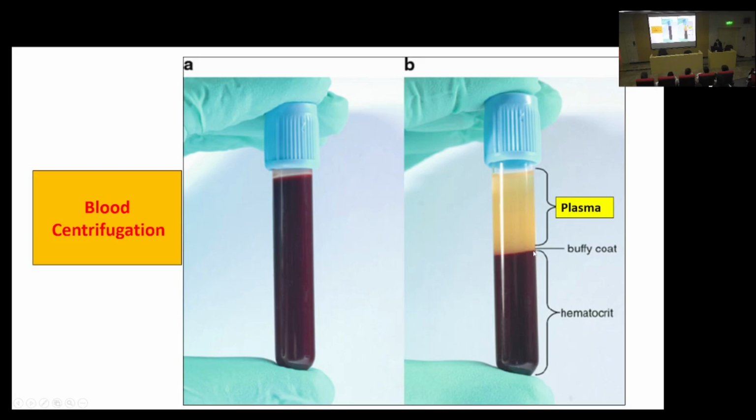The middle part, the buffy coat, I know it's not clear in here, but sometimes if you want to do PCR on DNA, right? So you'll get the DNA from white blood cells. You can't get it from red blood cells, can you? Because red blood cells don't have nuclei. Same thing with platelets. But what we do is we aspirate the fine white cloud-like layer in the middle. You might not see it clearly here, but you can insert a tip and gently suction it out, and then you can lyse it and break it and process it for DNA extraction and PCR.